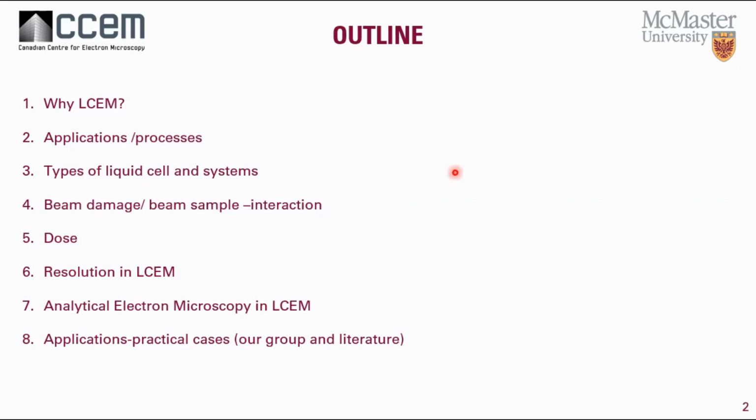I will talk about the beam damage and beam-sample interaction. I will cover a very important subject, the dose. I will talk about the resolution in liquid cell microscopy. And at the end, I will present two of the analytical techniques which can be applied in liquid cells.